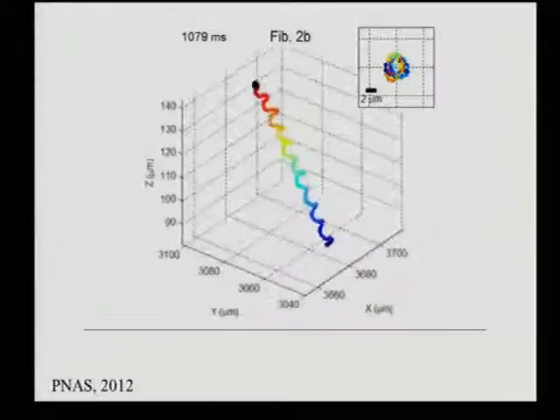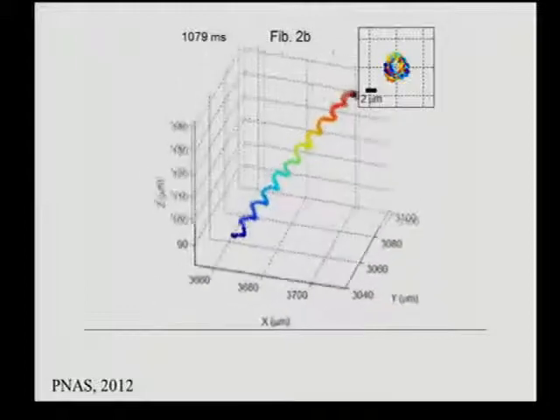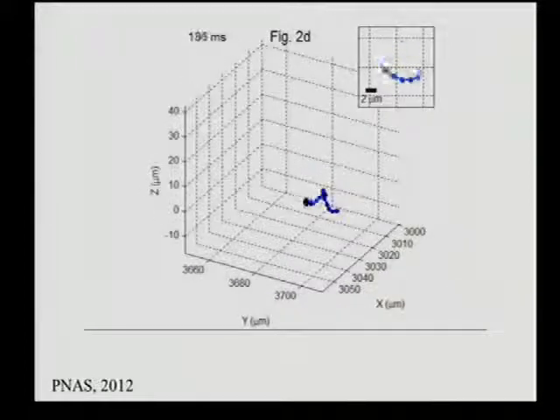And as you can see, it's quickly moving out of a certain depth plane. That's the reason why this kind of motion has never been observed using a traditional light microscope, because of the focusing problem as well as the low throughput. This is another one. It's a hyperactivated human sperm.